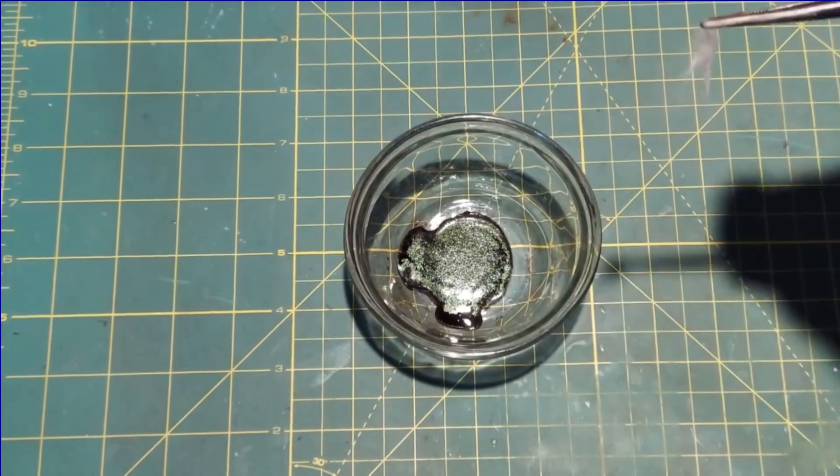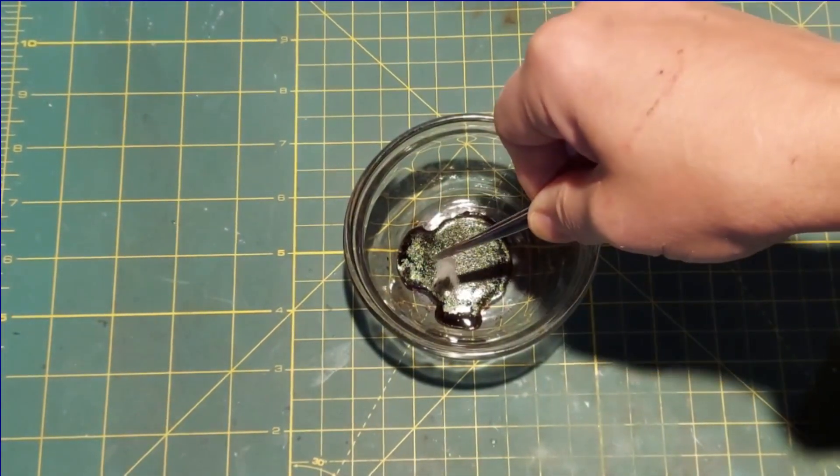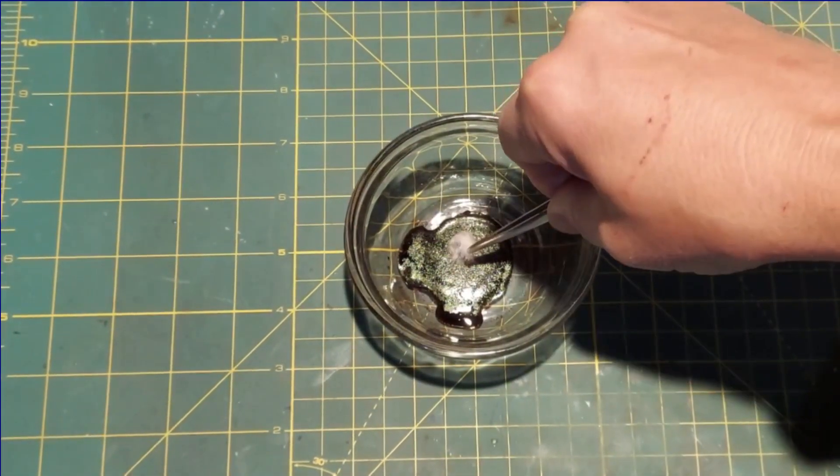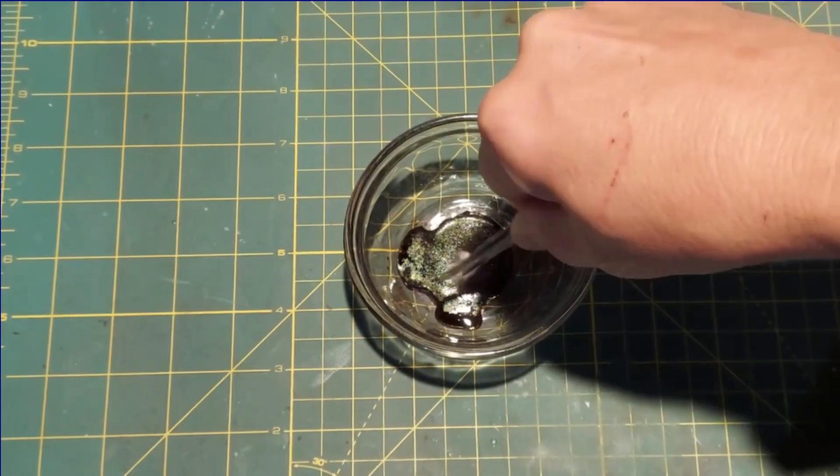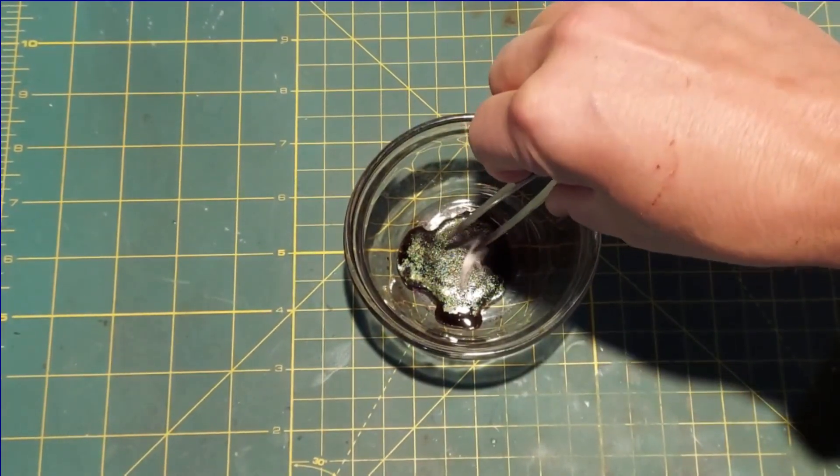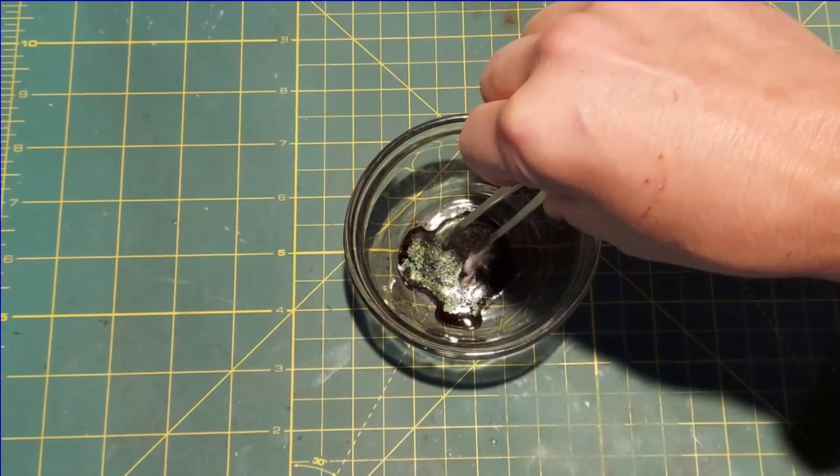So we hope we've formed the manganese heptoxide in sufficient quantities here, and I'm going to add this piece of cotton and we should see it react. If I can get it down into the material. There we go.